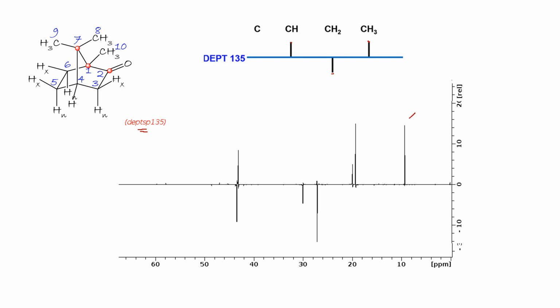See here, we have 1 CH3, 2 and 3 CH3s. We have CH2, CH2 and CH2, and here is our C4 with CH, matching well.